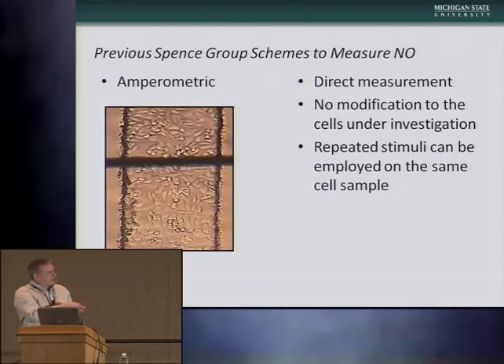What we did in this particular case, and I'm abbreviating a lot of the work here, but this is largely Scott's group, he would take a glass slide and using a PDMS slab that had a channel in it, he would basically pull carbon ink through that channel, bake it, dry it, and then pull that PDMS slab off the glass, and what he'd be left with is this small micron size carbon electrode, this carbon ink electrode, if you will.